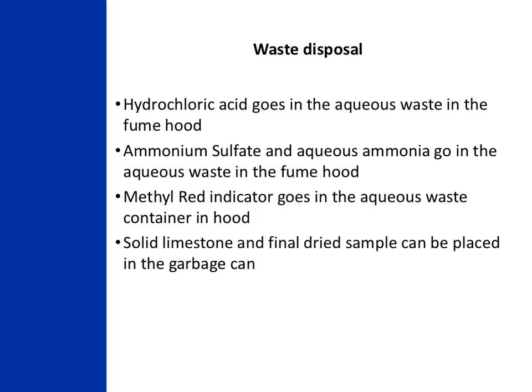For this lab, make sure you put the waste in the appropriate container. All acids go in the aqueous waste container, as does the aqueous ammonia and ammonium sulfate. Leftover methyl red indicator can also go in the waste container. And the solid waste of leftover limestone or other solids can go in the trash can.